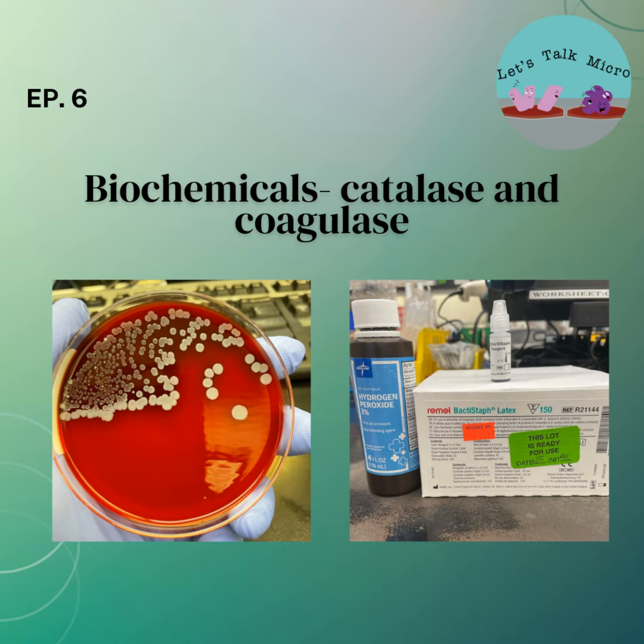So what happens when your catalase is negative? What's the next step? We know catalase positive, we think we have a staph. We do a coagulase, then we separate between Staph aureus and coagulase negative staph. So what if we have a strep? What do we do? Well, that's going to be on the next episode. I don't want to overwhelm you with too many biochemicals.